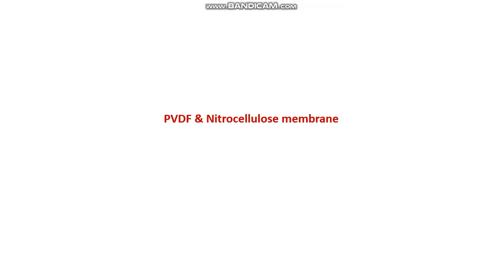In this tutorial video, I'm going to talk about PVDF and nitrocellulose membrane. So if you do Western blot, you need to know in detail about the PVDF and nitrocellulose membrane to select the right one. To know about that, you need to watch this video till the end. So let's begin. First, you need to know about the PVDF membrane.